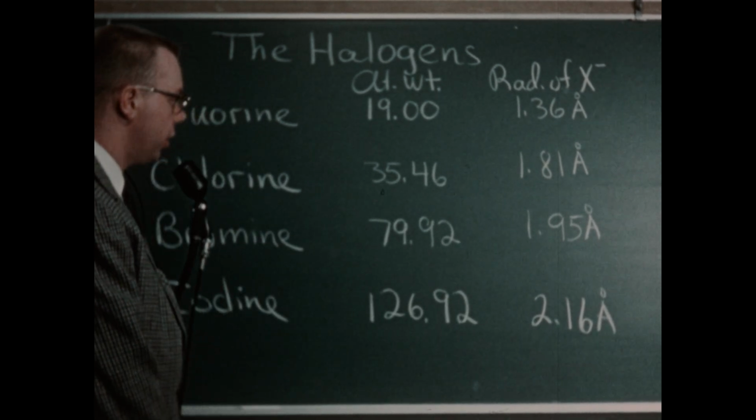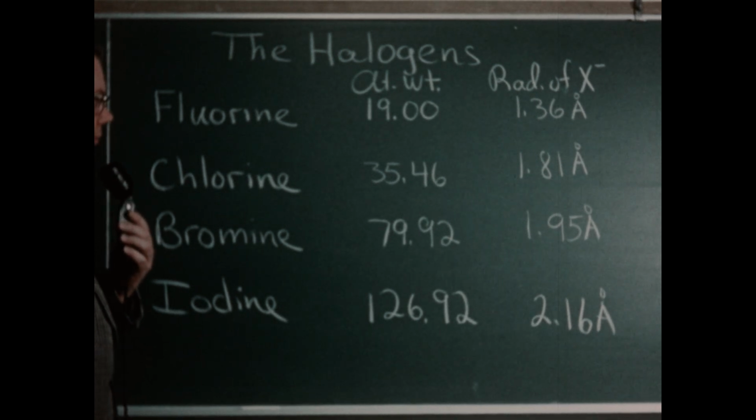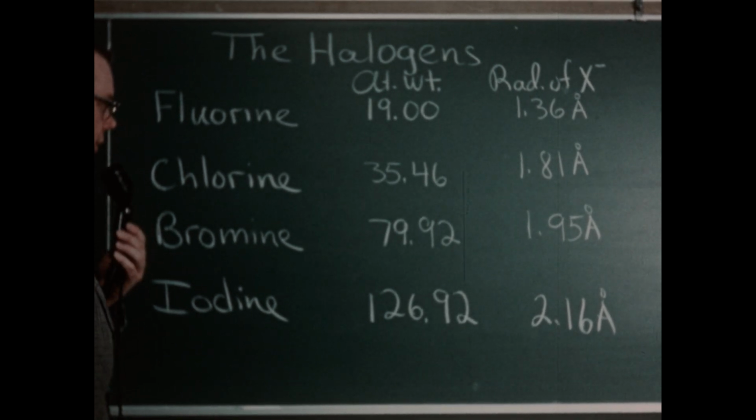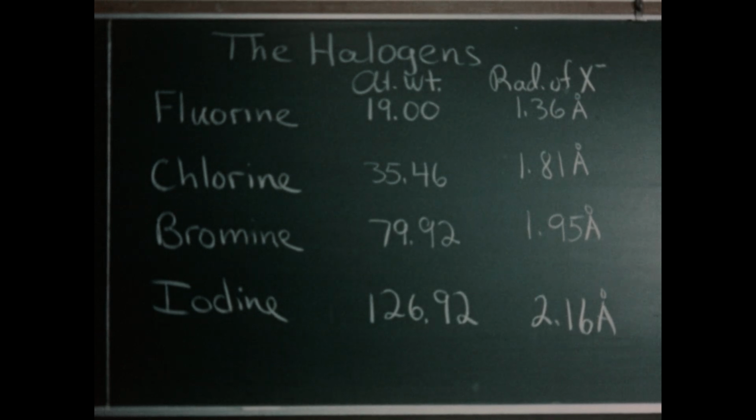In this film, we're going to examine some of the group relationships exhibited by these atoms, and we're also going to study methods of preparation for each of the halogens and some characteristic chemical properties of each halogen. First, we need to develop a test for the presence of chlorine so we can determine when this gas is present or is being produced by a reaction.